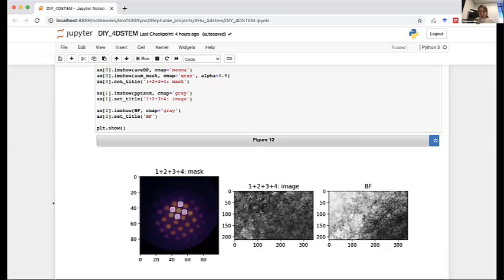And just before we conclude this section of the code, I'm going to take a quick detour to talk about plotting. One value in Python is that you can have a lot of control over how you're actually plotting your final image. That's maybe interesting for aesthetic reasons, but also very helpful for starting to understand and analyze your sample. So what I'd like to do is actually overlay these 2 images on top of each other to get a better idea of how these features interact. And that's not possible with a traditional color map because as soon as you put one image on top of the other, you block out what's underneath. You can use the transparency trick that I've been using so far, but as soon as you put one image on top of the other, you lose contrast for what's underneath.